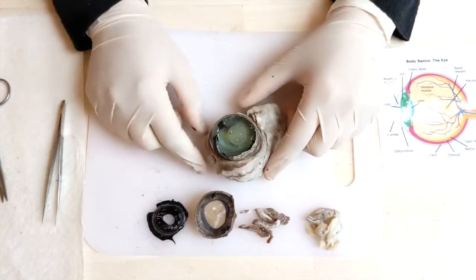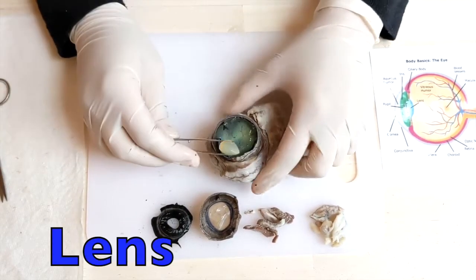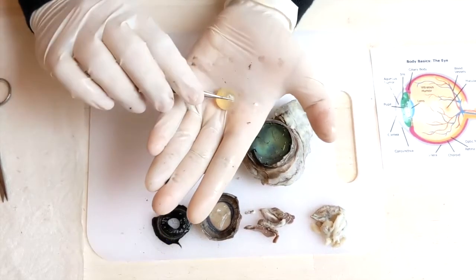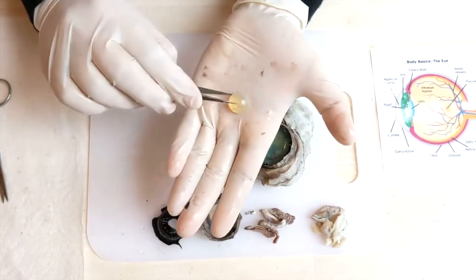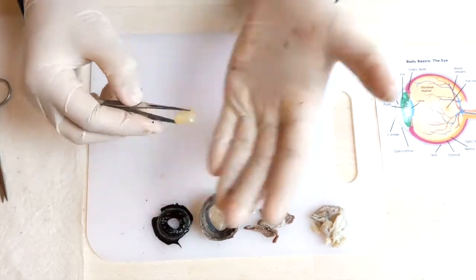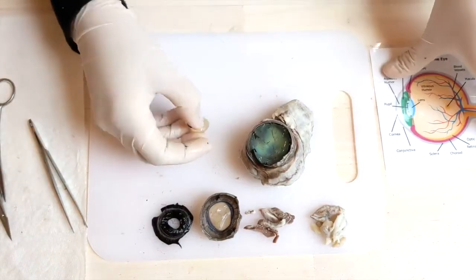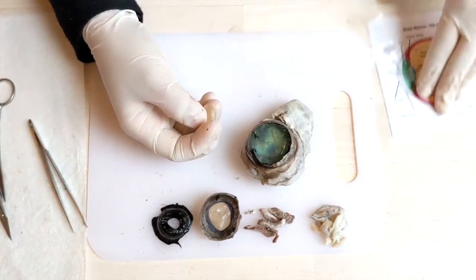The next thing I'm going to talk about here is the lens. This thing right here, okay? So, the lens, I want you to notice the shape of the lens. The shape of the lens is very important. We're going to talk about that. And also, before I cut through the lens, let's do an experiment.